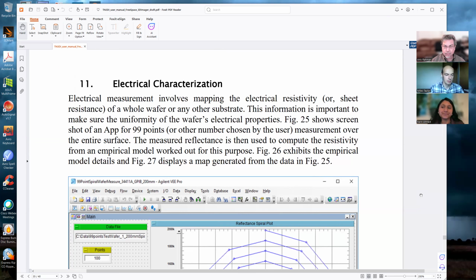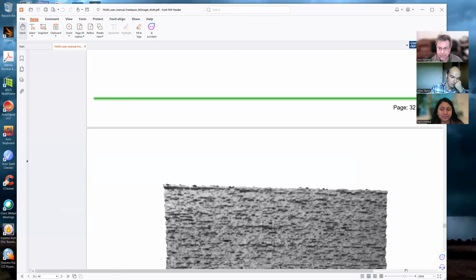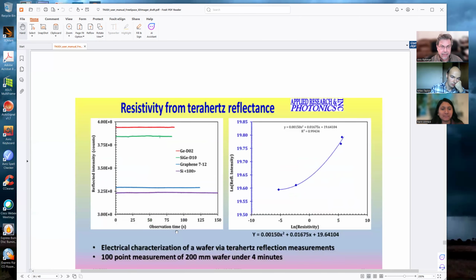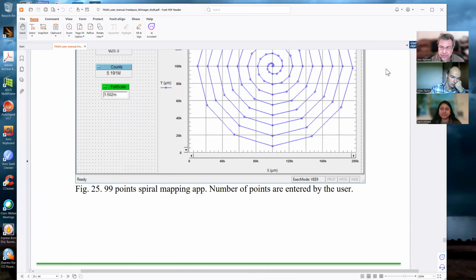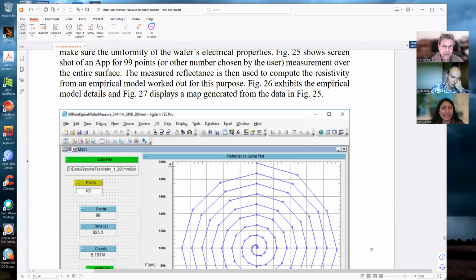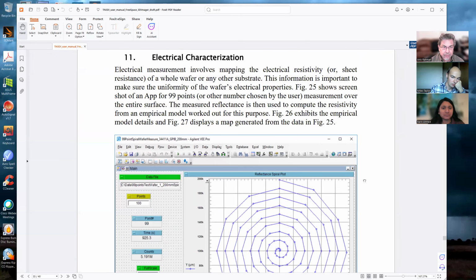Okay. So today, we have introduced the instrument, then imaging details, and today, with the same instrument as you do the imaging, you can also do what is called electrical characterization, and a lot of times, electrical characterizations are important.